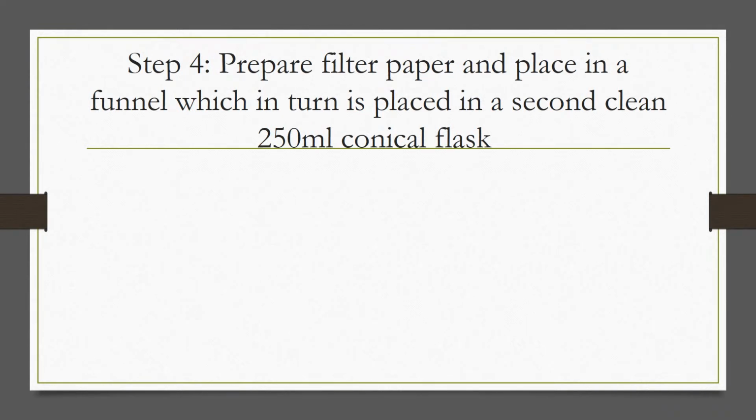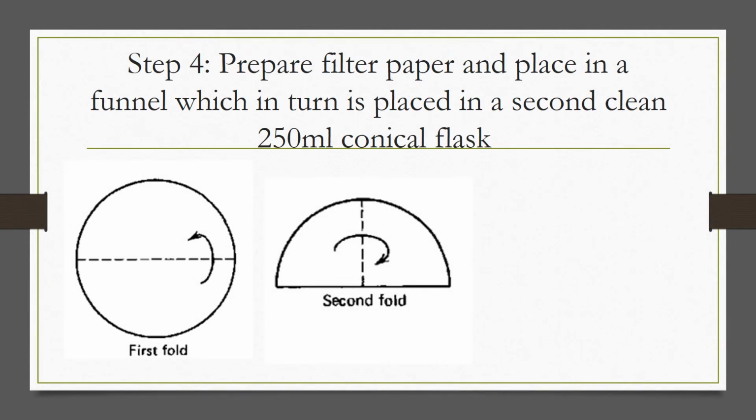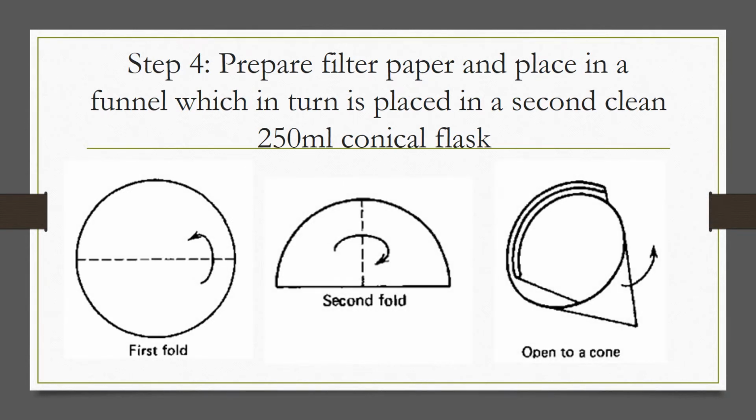Step 4. Prepare filter paper and place in a funnel, which in turn is placed in a second clean 250 ml conical flask. To prepare filter paper, fold the filter paper in half, then fold it in half again, and open it up to a cone shape. Place it in a funnel and wet with deionized water to ensure stability. Pour solution through the filter paper into a second conical flask. The solution should be clear.